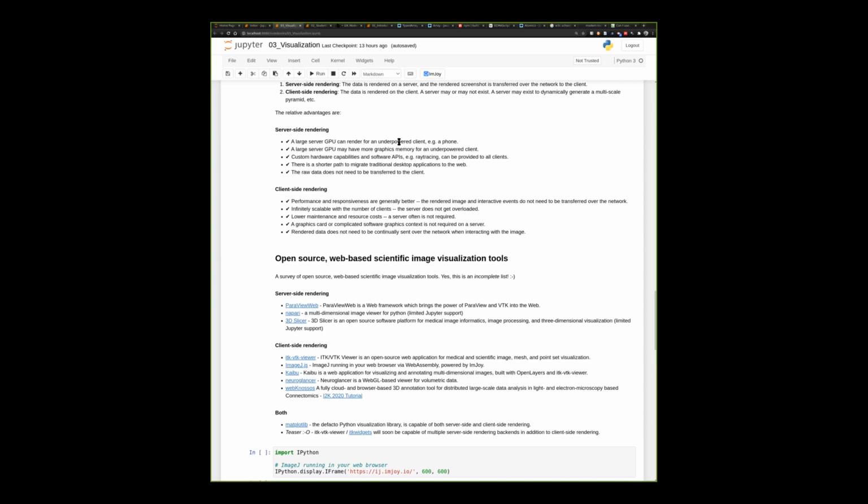The difference is determined by how much data needs to be sent and how much interaction you're going to have with the data. If you're continually rendering and interacting with the data, you'll always be sending screenshots, and in that case, it may require more network transfer.